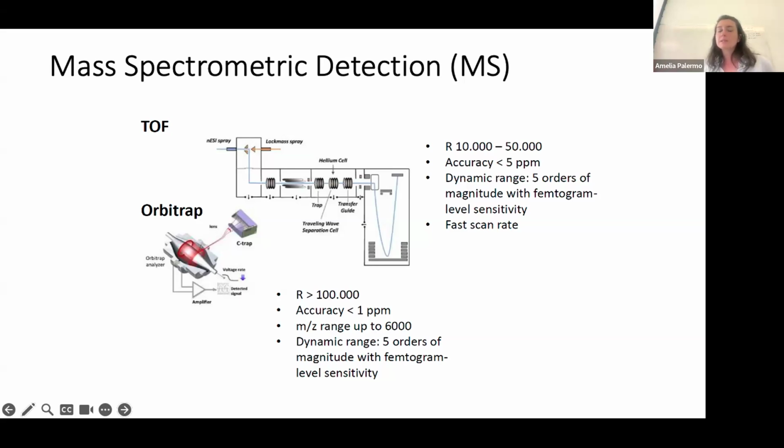In metabolomics, that is important to a certain extent, because you usually have peaks that describe a molecule, a metabolite, with 1 unit of difference, right? You will have the molecular +1, the molecular +2, the molecular +3. And for that, you need some resolution, but I would say a resolution around 10, 20,000 is already good for that. Does it answer your question?